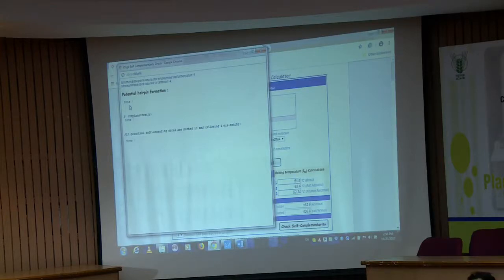Right. So, this is one step, how we have to design our primers for PCR amplification. Now for PCR, what all do you want? You want the template, which you already have. Primers you have already designed, forward and reverse primers are with you. dNTPs you want, enzyme you want, and buffer you want. You can select any of the companies for that. Many companies provide cocktails also, or you can do it individually also, right.